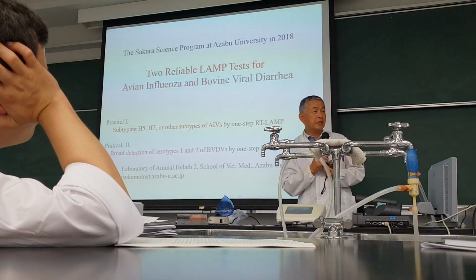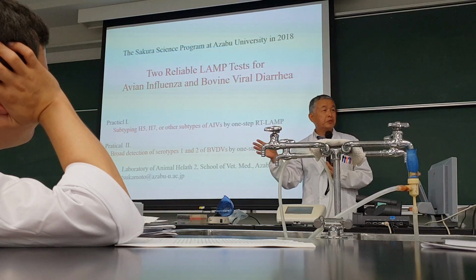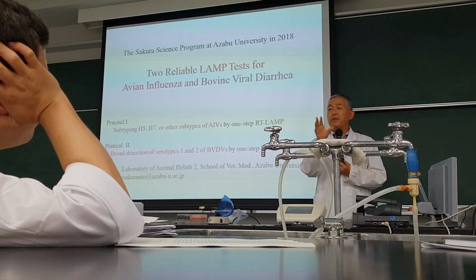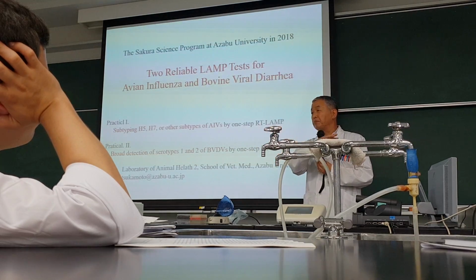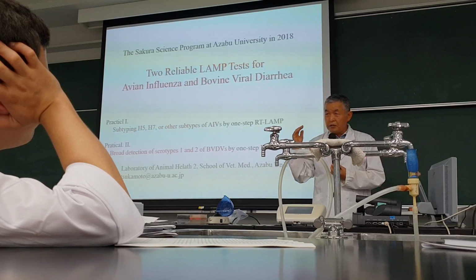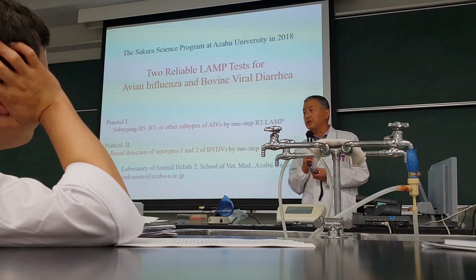The idea is that if we can divide the gene pool into several groups, then each group may be detected with each primer. When we prepare all of the primer sets and combine them after mixing, it is useful for detecting all of the genes registered in the gene bank.